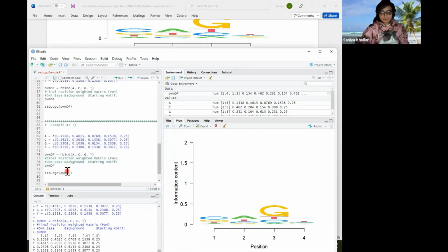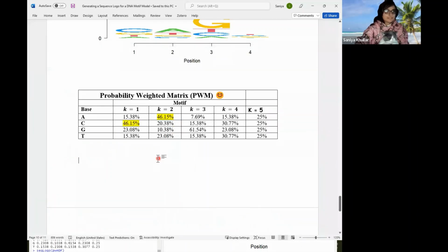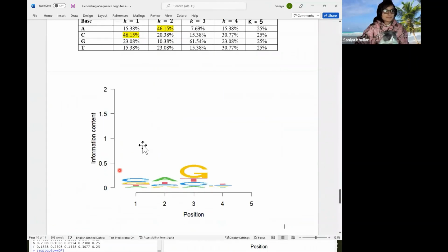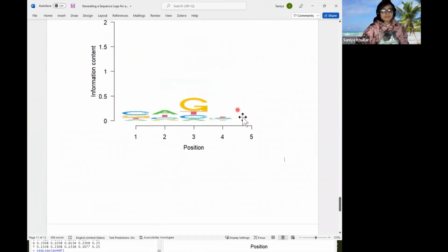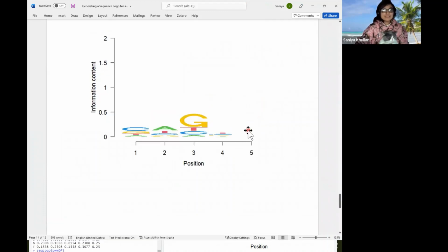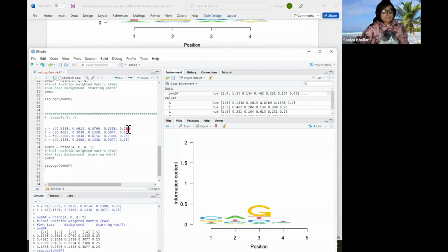And now we can do the seqLogo here. And we can copy this image here and see what this looks like. You can't even see it. There's virtually no information from this. Whereas before there were 4 positions, now there is a 5th position here. And even if I made this 26, for instance, and scaled this down to 24, let's see if we get anything at all from there. Probably not. If I made this a 26, so that it all sums up to 1, otherwise it'll complain.